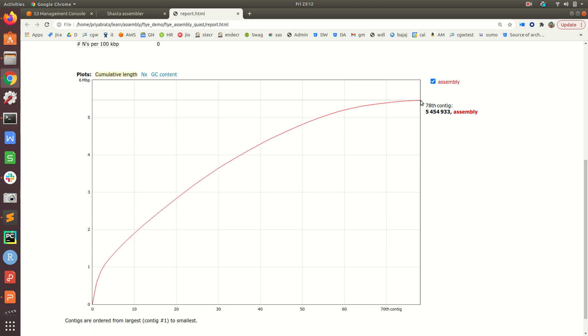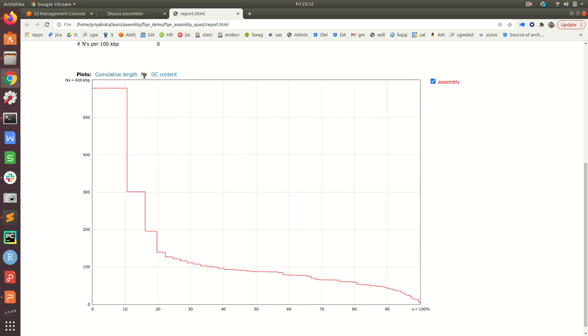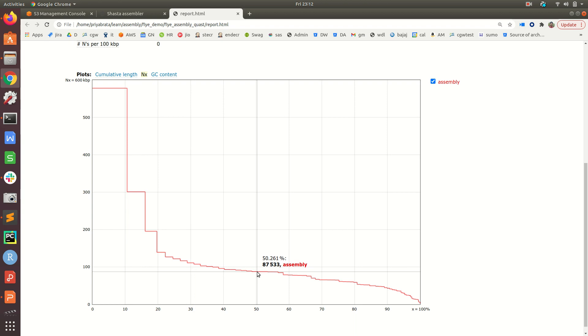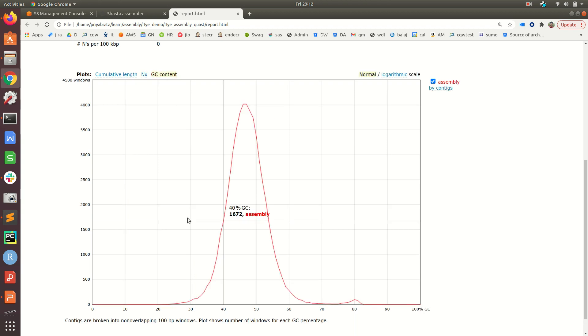The next plot is the Nx plot where the x-axis consists of the N levels like N10, N20, N30. Here we can see the N50 value is around 87,811.